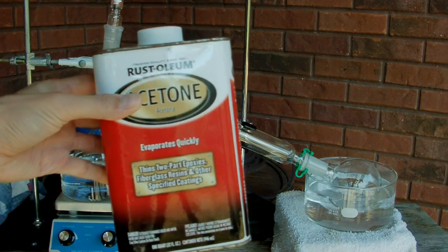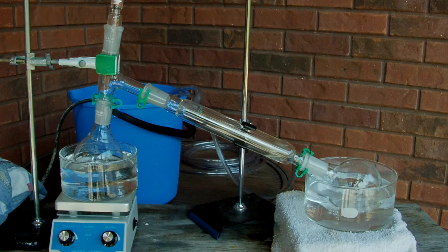Acetone you can buy at hardware stores as a paint thinner. The idea behind a simple distillation is to just heat your liquid up to its boiling point and then recondense it in another flask. If you have a mixture of liquids — in this case acetone and water, along with probably some other organic contaminants — if their boiling points are sufficiently different, you can use this method to separate them, because the lower boiling point component will turn into a vapor first, condense, and you'll collect a purified product at the end.